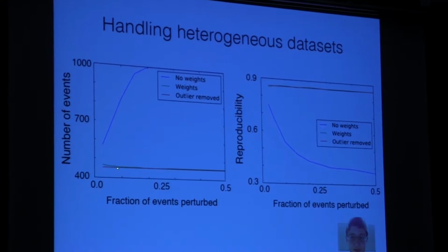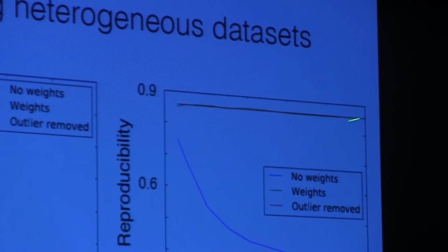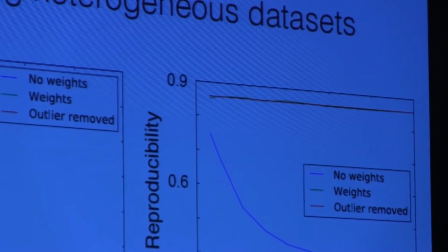But it's hard to see here, but with his weighted model, you basically recover as if the outlier was removed, and you have all good, nice looking samples. So we think this is applicable for patient data.